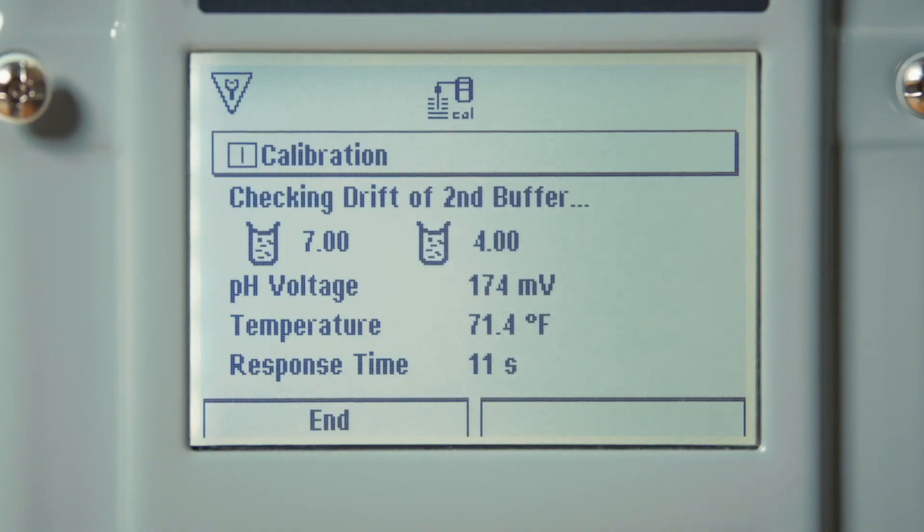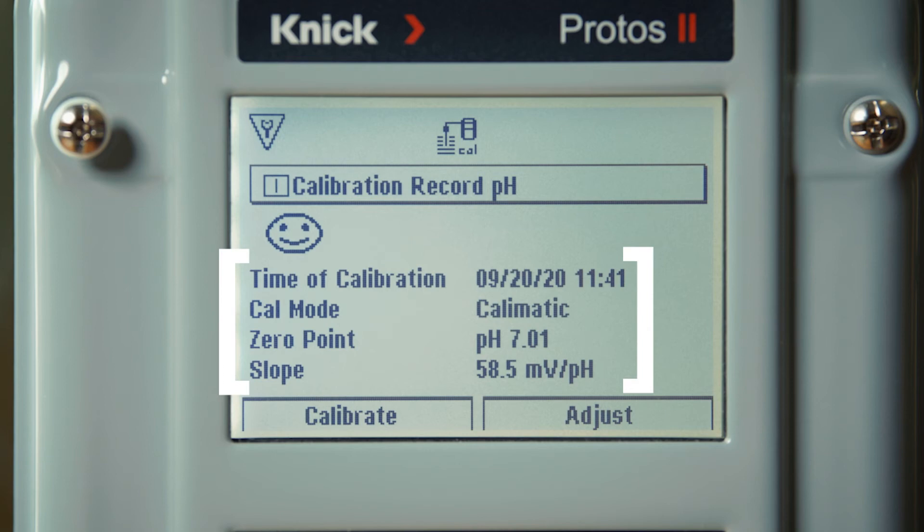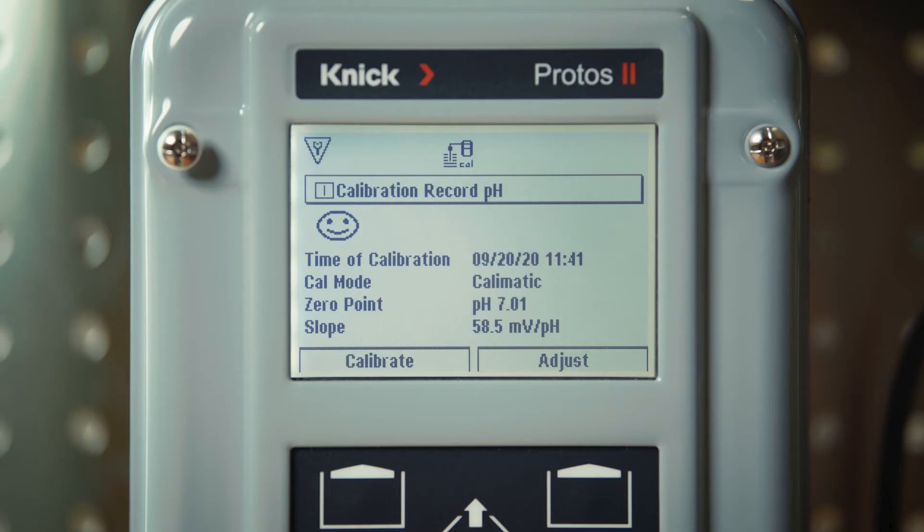As with the first step, you can see that the transmitter automatically recognizes the buffer value and displays the pH voltage, temperature, and response time. Once complete in the second buffer, our Protos displays the specifics of your calibration record. Here you can see we have a timestamp of our calibration followed by the calibration mode and the specific values of the zero point and slope of the electrode.